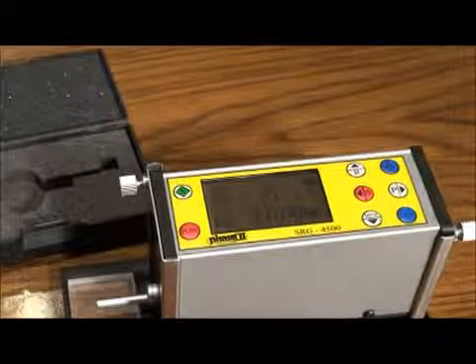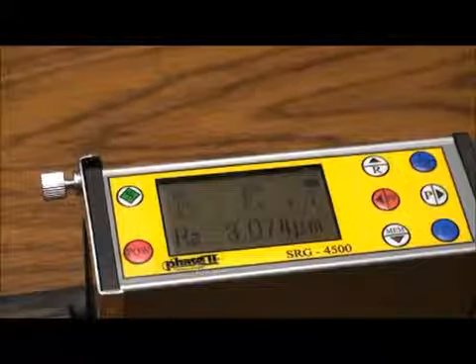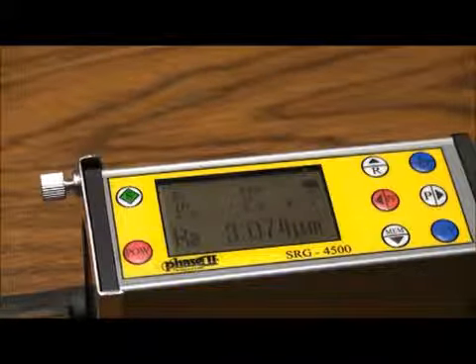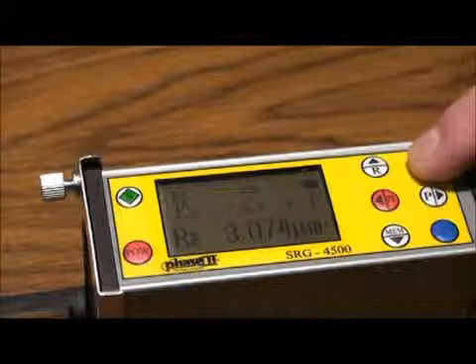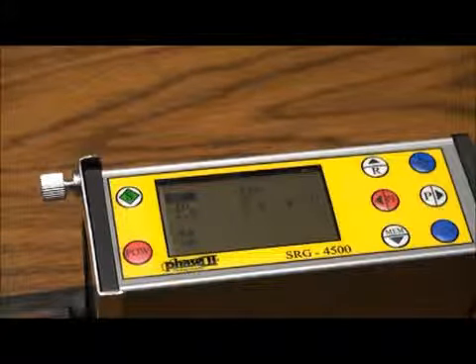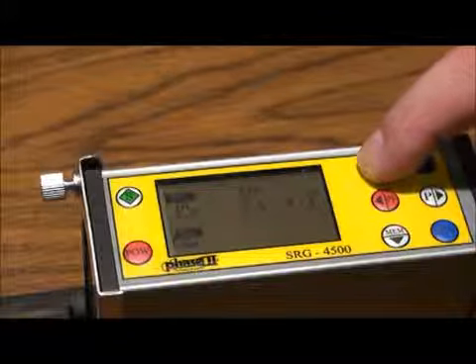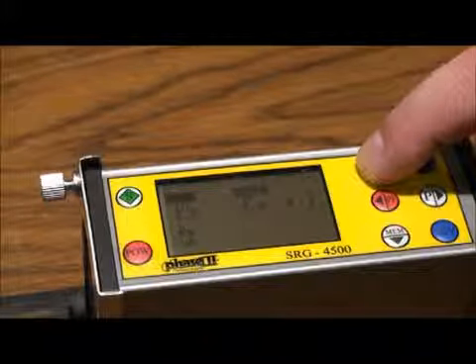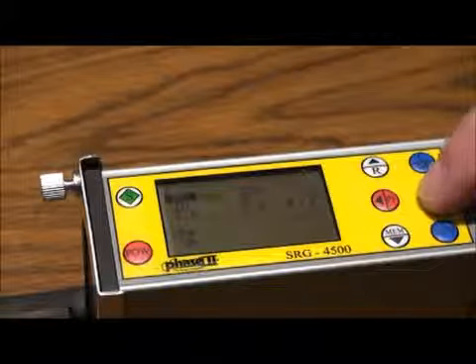The level key can also act as an enter key at times throughout the menu. The LM button will bring you to the menu functions and settings interface. Press the LM button once and you'll be brought to a quick setup screen. The up and down arrow buttons will take you through various parameter settings, while the left and right arrows will allow you to toggle within a given setting.